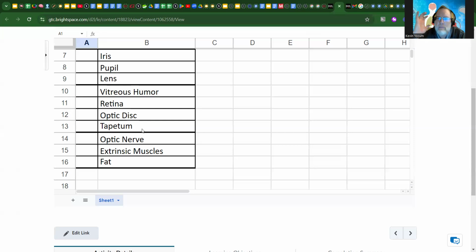There'll be some aqua, blue, green shades in there, maybe even a little bit of purplish, bluish violet. Some of them are just kind of a dark violet color. So we'll look at all of those. It's kind of the pearl in the oyster, I guess, seeing what the tapetum looks like.